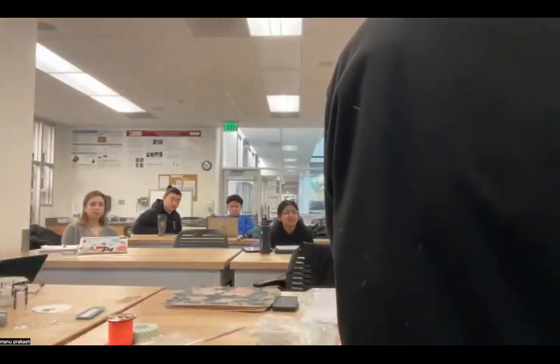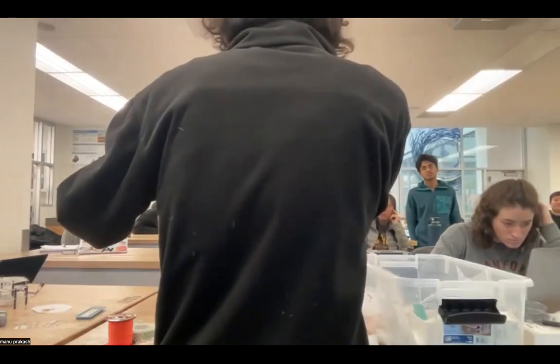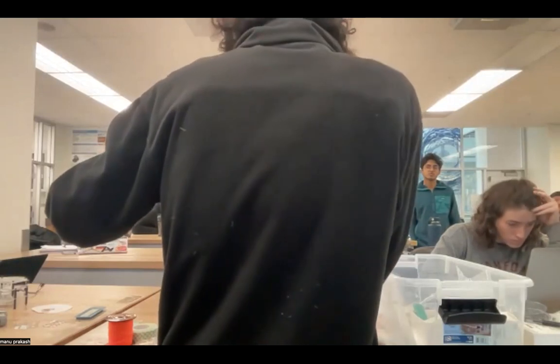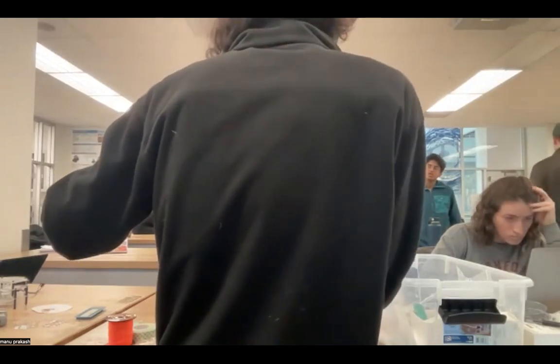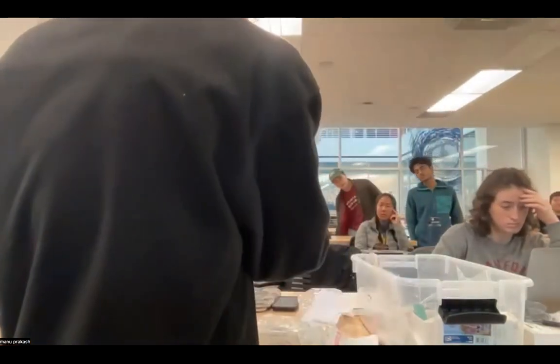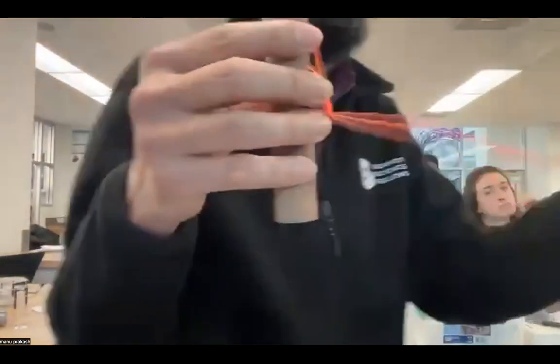At some point, because my spacer has failed, it will crack. And there are times where if I use the wrong kind of paper, I can spin it so fast that it will fracture, so the paper will shatter. Remember we talked about this, so I'll now pass it to, so I'll just show it.